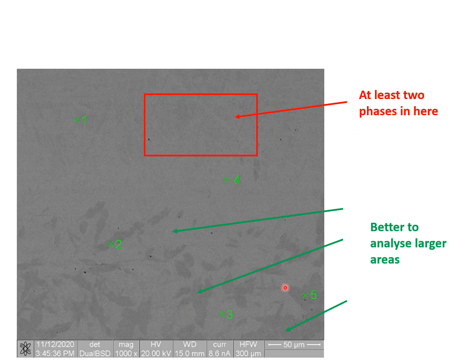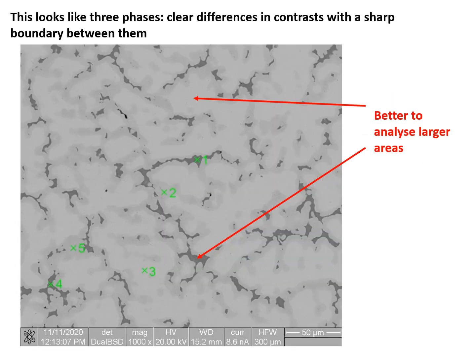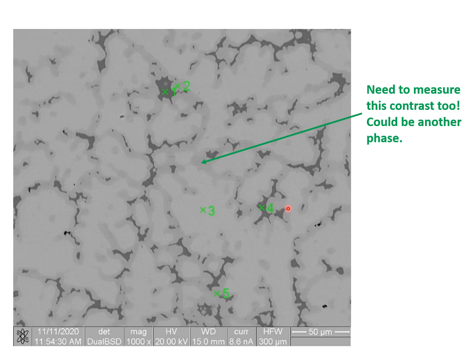And be careful what's going on here. There's some areas which have been analysed, but he could have picked this area of dark to analyse, and be careful of what's in there, because that's not single phase. It looks like two phases. And then here's some more stuff that was being analysed. Now, he hasn't chosen the biggest. Look at that, it's small. He could have chosen that for the dark, and he could have chosen this or that for the light. And then this does more of the same, but why not analyze this nice big area for medium?